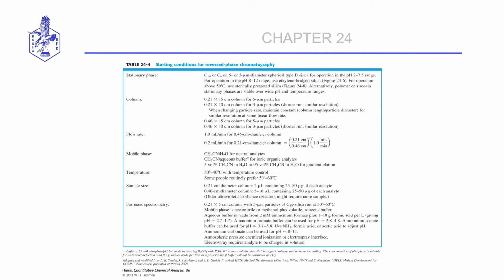So in summary, here is a list of all of the choices and selections one makes with regard to stationary phase material, the silica onto which the stationary phase is bound, the column, its dimensions, the flow rate, the mobile phase selection, the gradient, the temperature, sample considerations, and then at the end we have to choose a detector.